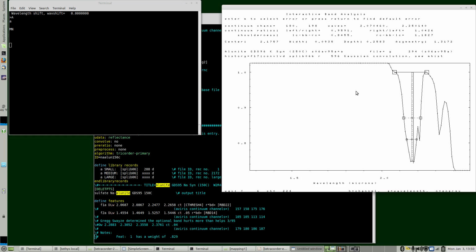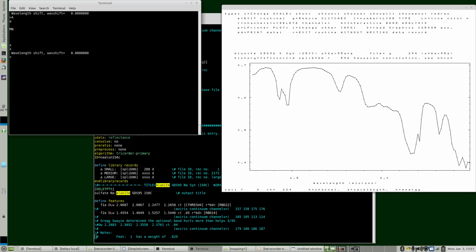If we needed shoulderness, then we'd have things here that would help us define the shoulderness. See the shoulderness line. In this case, we don't need that. And that's a decision that you get with experience on what we're trying to distinguish between other things. And in a later session, we'll do shoulderness. So this is fine, but that's not the information we need.